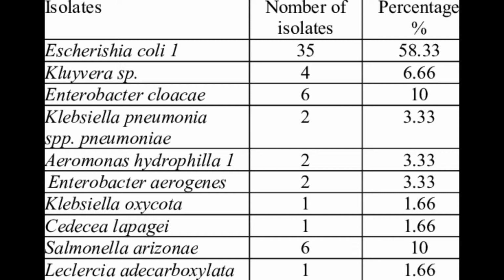Now let's talk about the methyl red test and the Voges-Proskauer test. Starting with the MR test, acetate and formate are strong acids. The medium is MRVP broth. The reagent is 5 drops of methyl red indicator. The positive is a red medium, with a pH of 4.5 or less. If it is negative, it is a yellow medium, with a pH of more than 5.6.